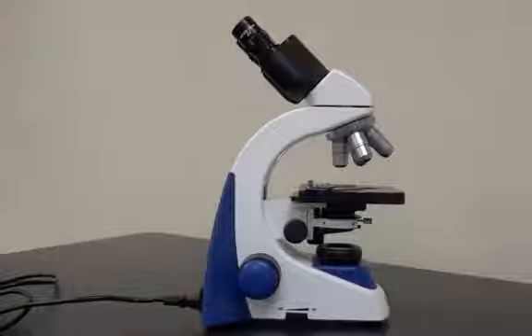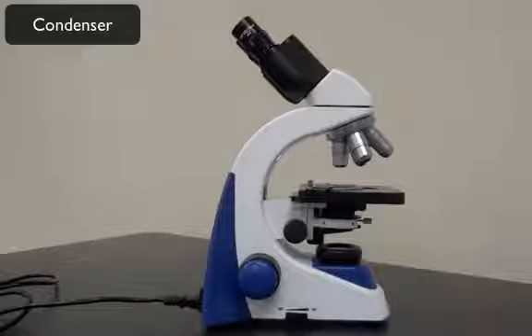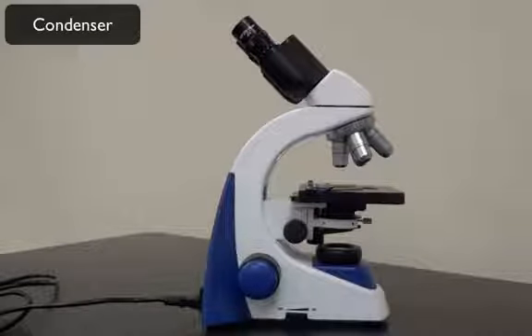Now another thing that we have right below the stage is called the condenser. That just helps focus the light on the actual slide. And the condenser has its own little dial here. We want to make sure the condenser is all the way up. Okay? We don't need to get into much more detail than that.